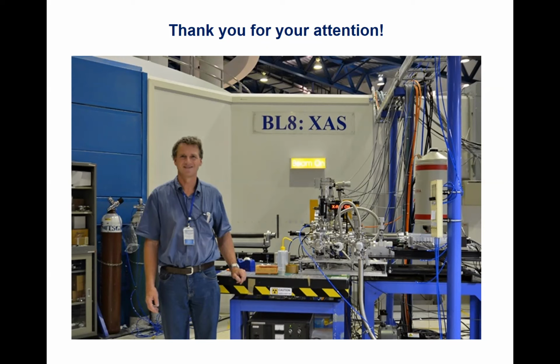And then XRFs, I completely agree with you, would be a nice tool to address this question. And then say, okay, very likely the soils are behaving in a very similar way as our artificial mixture has done. Yeah, that may be the way to go. Thank you.